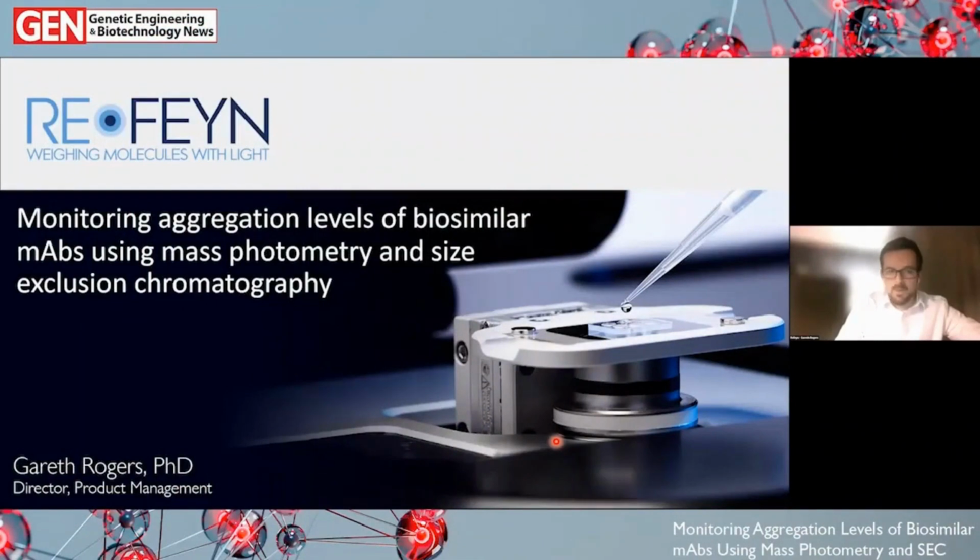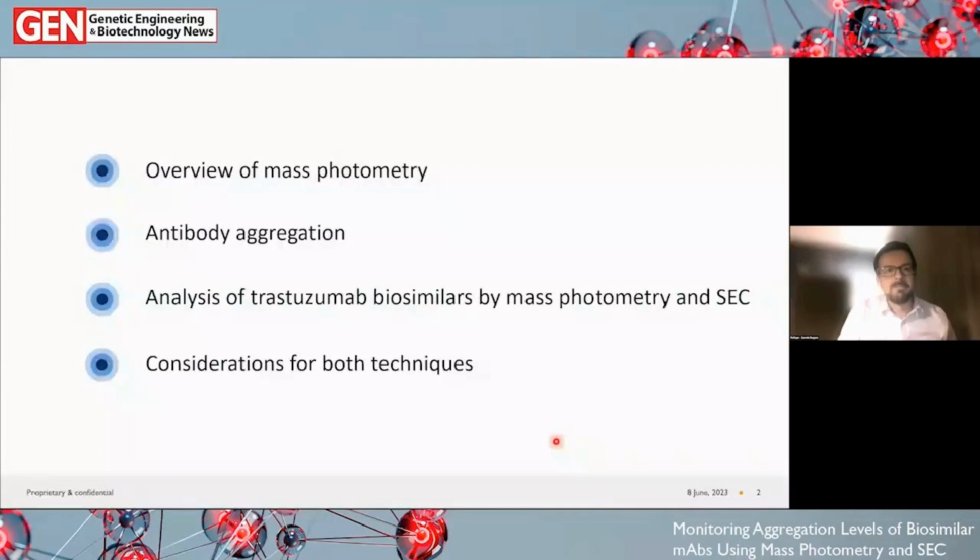Right, hello everybody. My name is Gareth Rogers. I'm a Director of Product Management at Refeyn Limited. So thank you for joining this webinar today. I'm going to be talking about the monitoring of aggregation levels of biosimilar monoclonal antibodies using mass photometry and size-exclusion chromatography. So just to give you a brief overview of what the presentation will entail.